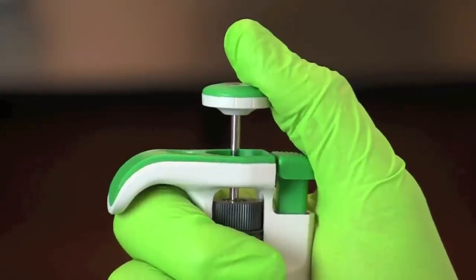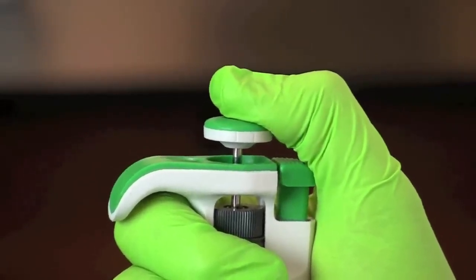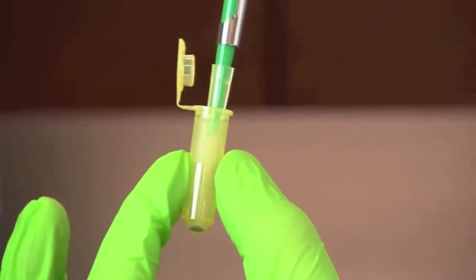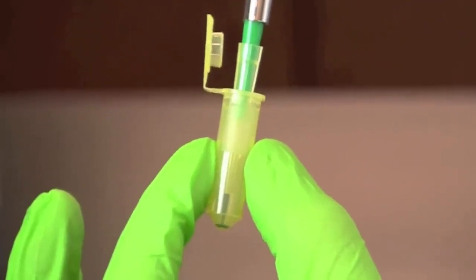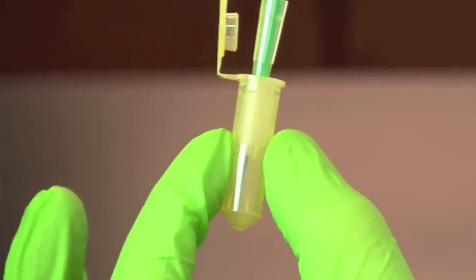To obtain a DNA sample, slowly depress the plunger on your adjustable micropipette to the first or soft stop. Holding the plunger down, insert the tip of the pipette into the microtube with the DNA sample. Place the tip close to the bottom of the sample, then slowly release the plunger button.